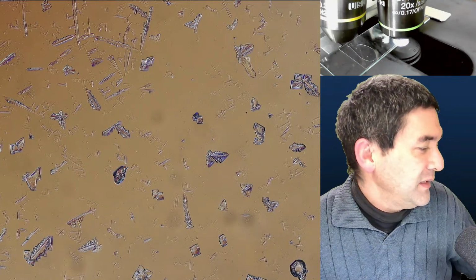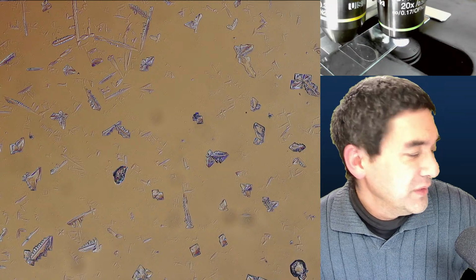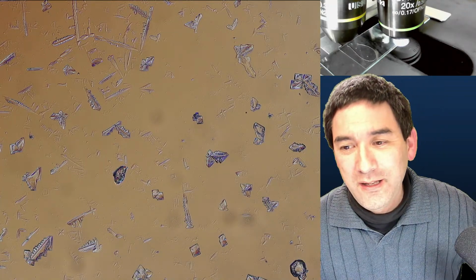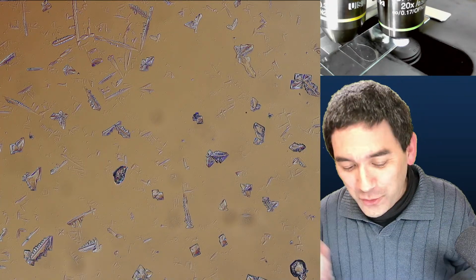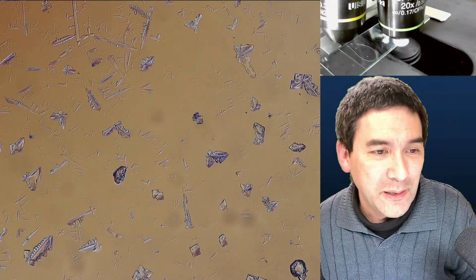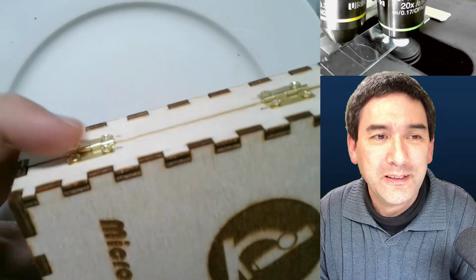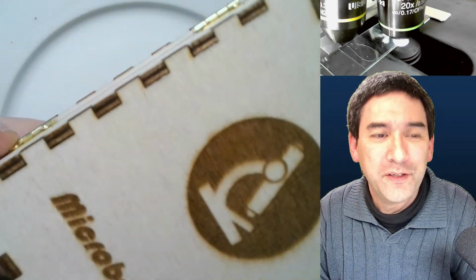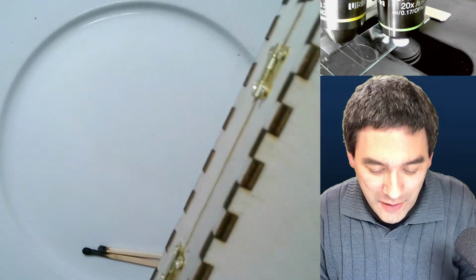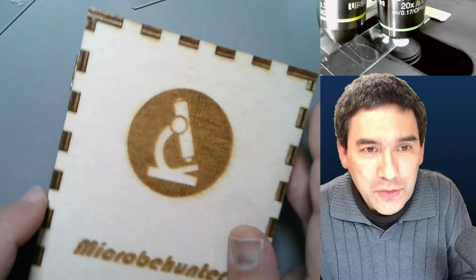Okay. Somebody is, I think, referring to this box over here. That might be something that I'm going to show you also very quickly, because it's already slowly time to finish. Look what I've got here. I found some hinges now for this. For those of you who don't know, I made this with my laser cutter. I made myself a slide box.